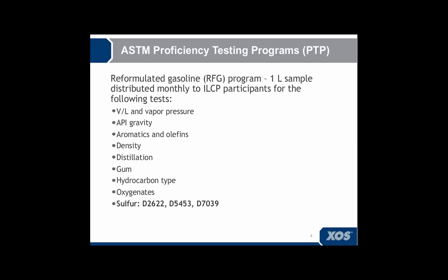You'll see at the bottom of the slide, they test sulfur using D2622, D5453, or D7039. The most interesting thing about these studies is that they provide multiple data points over a longer period of time.